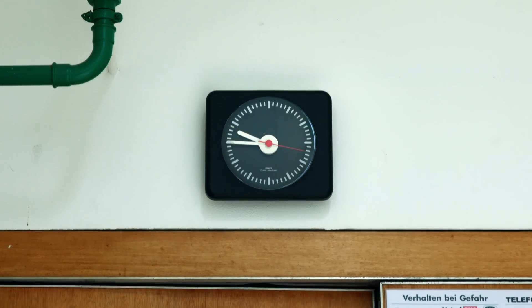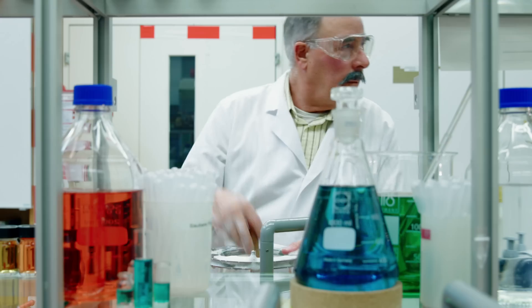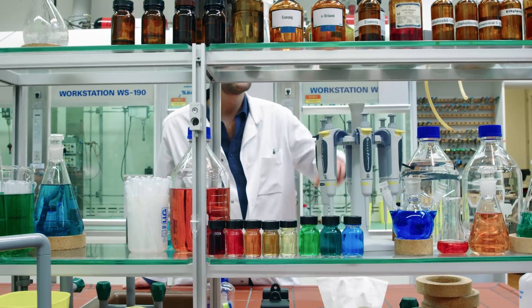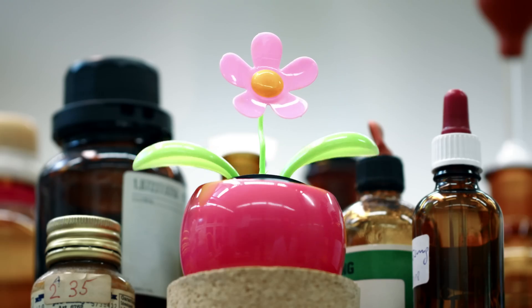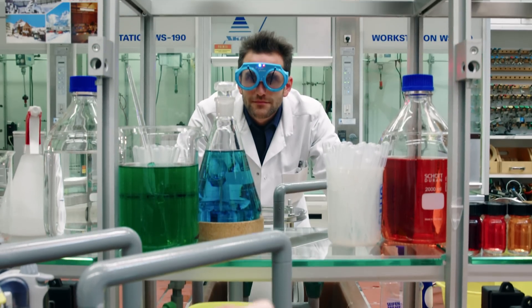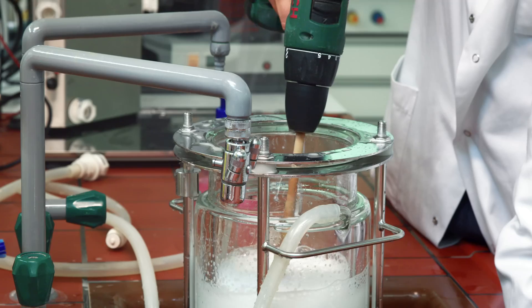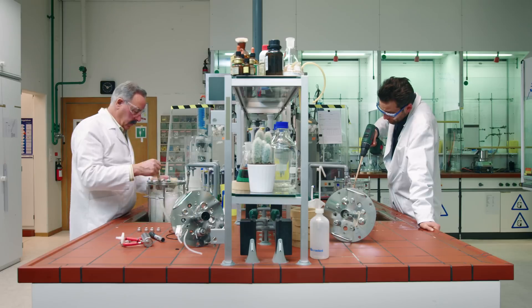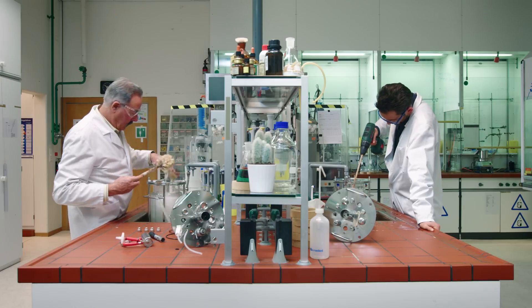Between half past eight and ten o'clock, Mr. Schmidt also shows up. Mr. Schmidt wants to keep his workstation up-to-date. He's always open to new solutions that simplify his work. However, cleaning the bioreactor still requires a lot of effort.